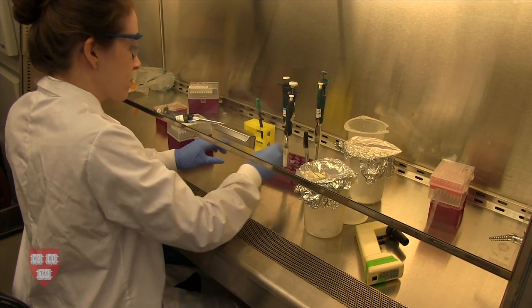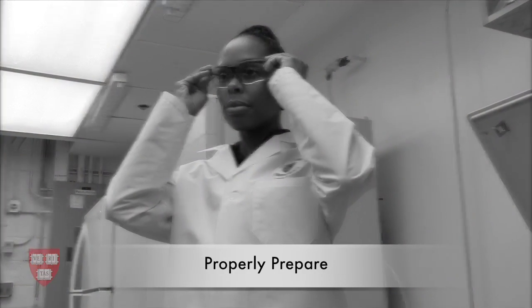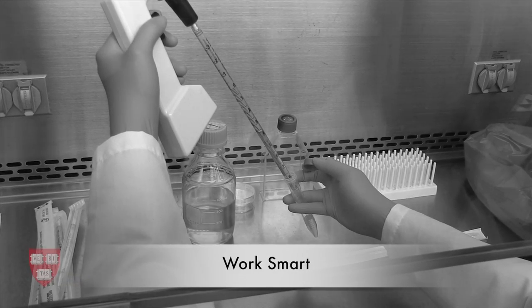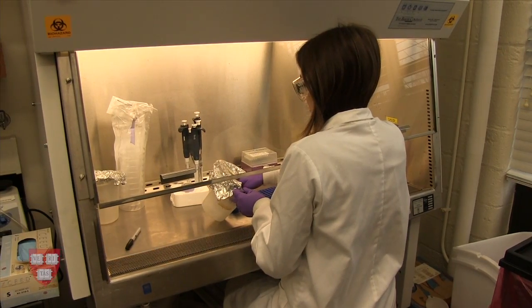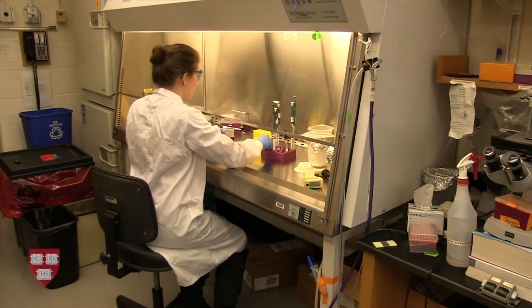Protect your experiment from contamination by using a biosafety cabinet. Remember to prepare yourself and the cabinet for work. Use aseptic techniques when working in the cabinet. And properly close out the BSC when you're finished. By using the cabinet correctly, you minimize the chance for contamination to interfere with your protocol.